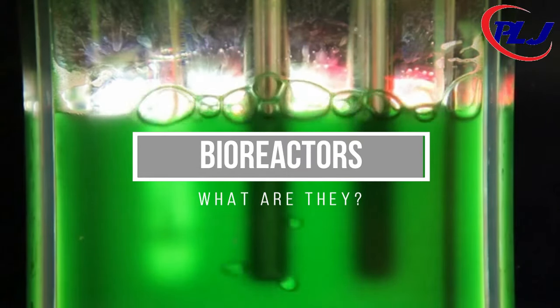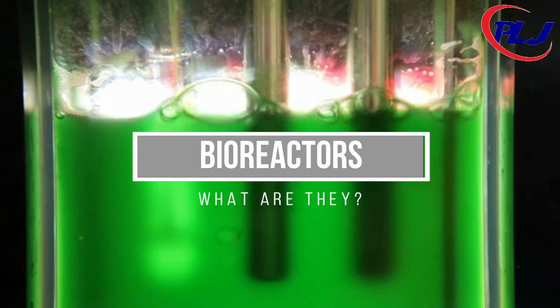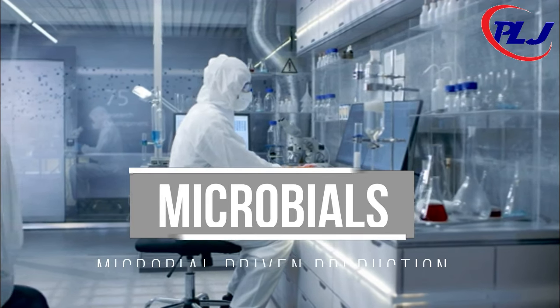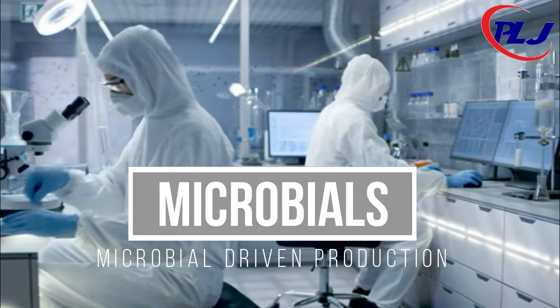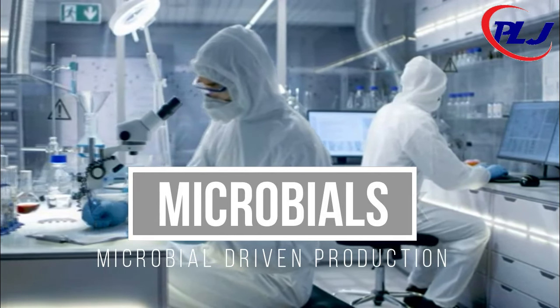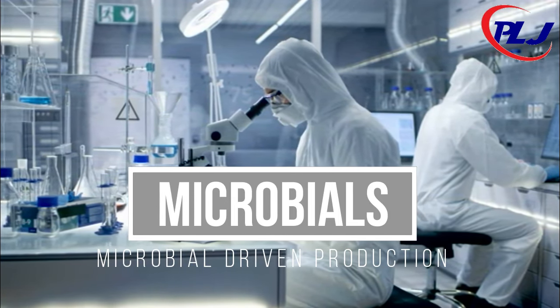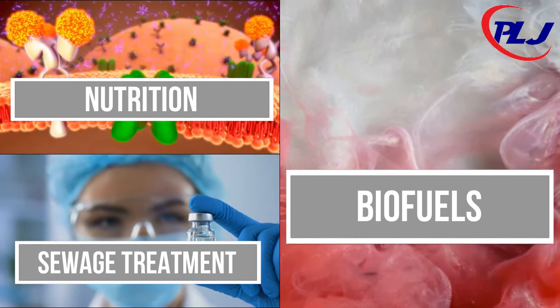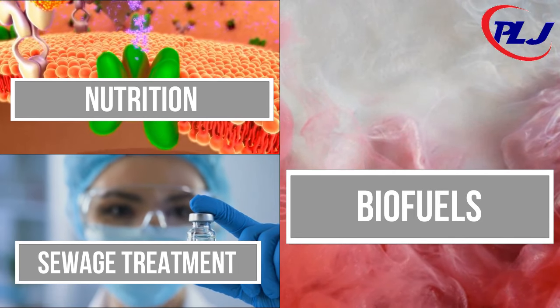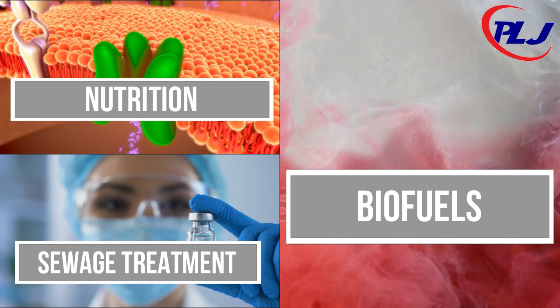These vessels are utilized to support the growth conditions of microorganisms carrying out fermentation. Its design and construction must provide the optimum environmental conditions to the microorganisms. Fermentation is effectively applied in many sectors, which include production of bioethanol for biofuels, sewage treatment, and the food industry.